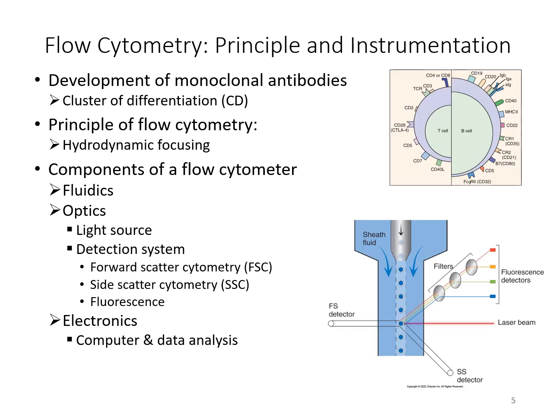In order to understand how flow cytometry works, we first have to make sure that we understand what exactly we're looking for.